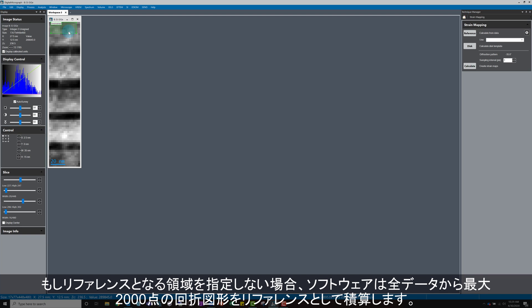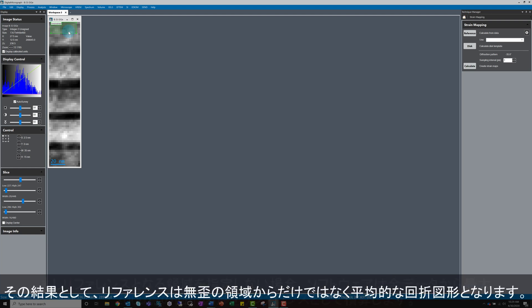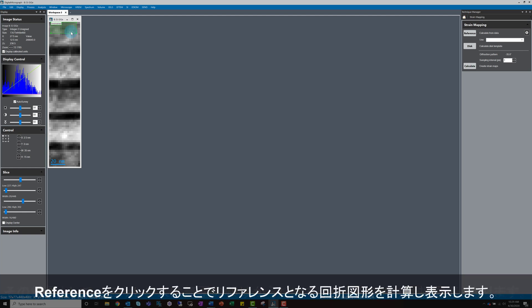If we didn't specify a reference region, the software will just sum up to 2000 diffraction patterns from the whole dataset as the reference, in which case the reference is the mean diffraction pattern. Here the strain results would be relative to this average instead of an absolute comparison to a region that we defined as unstrained. Next, click on reference.